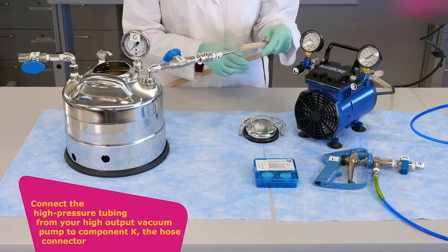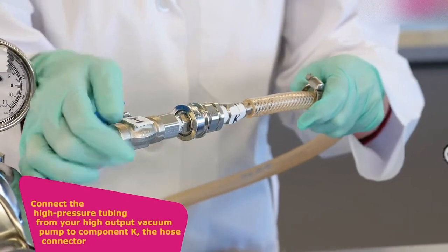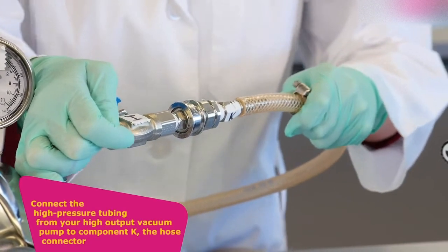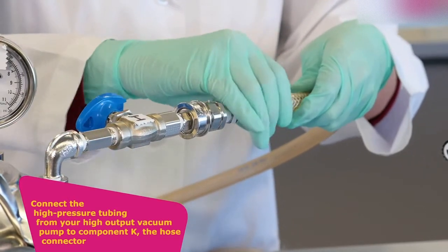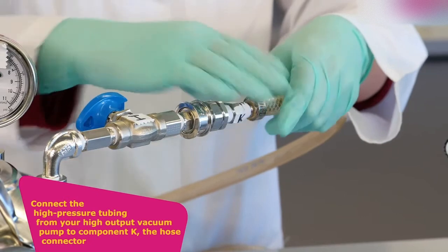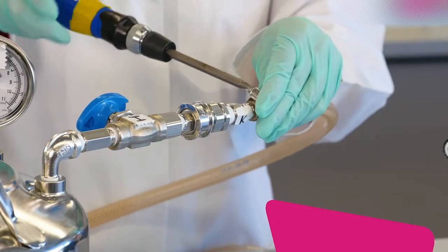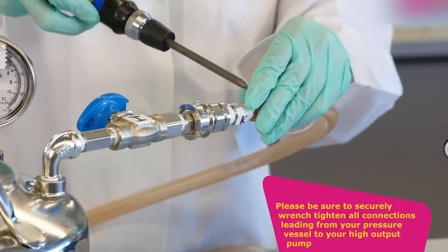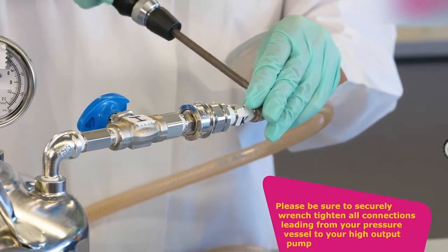Connect the high pressure tubing from your high output vacuum pump to component K, the hose connector. Please be sure to securely wrench tighten all connections leading from your pressure vessel to your high output pump.